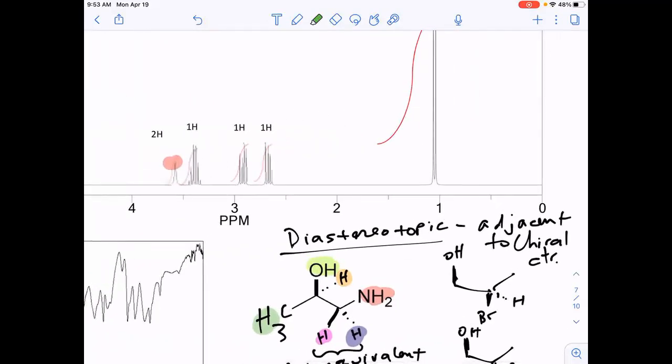Is it 1? Yeah, it's next door to that carbon with the hydroxyl group on. So for that, N is going to be 1. And then N plus 1 is going to be 2, so it should be a doublet. And we can see it's down where alkyl protons show up, somewhere between 0 and 1, right?